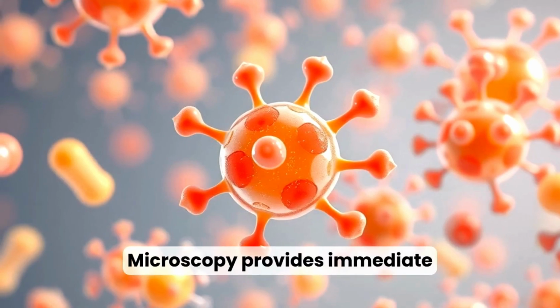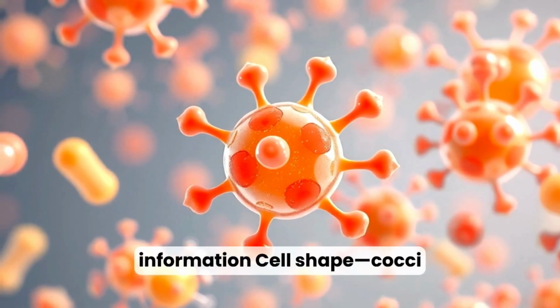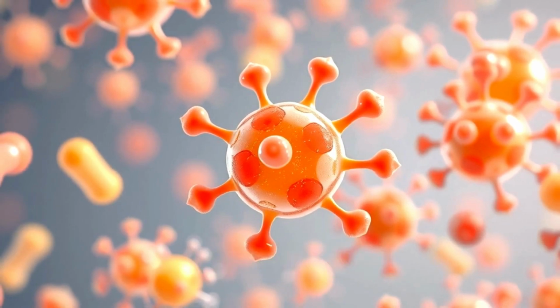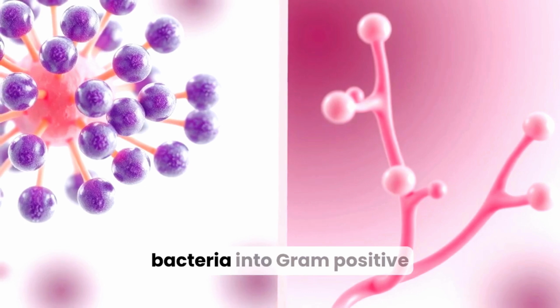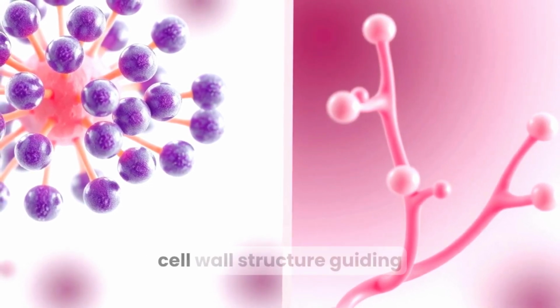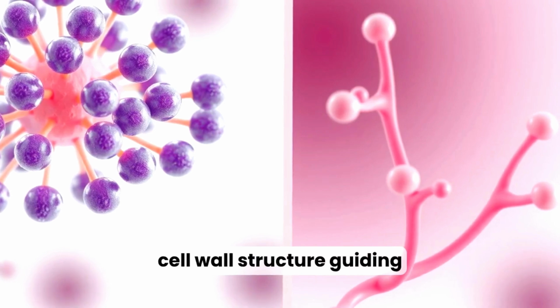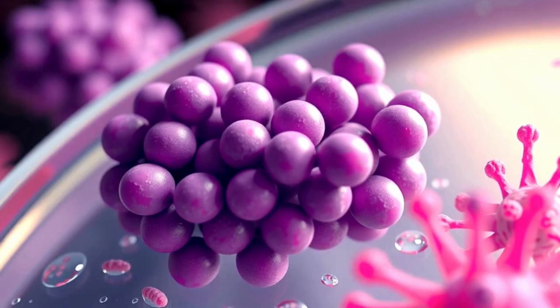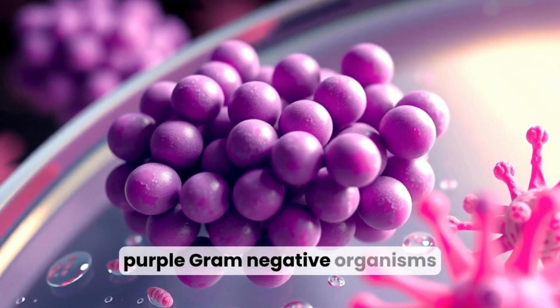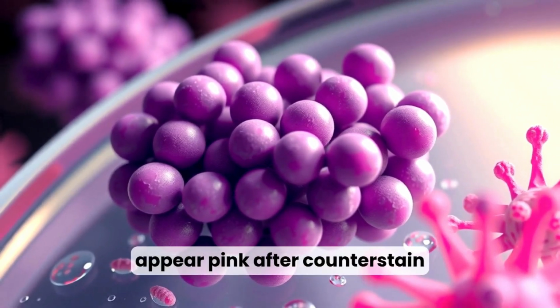Microscopy provides immediate information. Cell shape, cocci, bacilli, spirilla, narrows the field of suspects. The Gram stain divides bacteria into gram-positive and gram-negative based on cell wall structure, guiding antibiotic choices. Gram-positive organisms retain crystal violet and appear purple. Gram-negative organisms appear pink after counterstain.